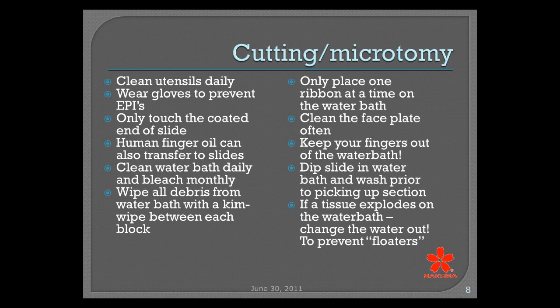I also train my techs to wear gloves when they're cutting. This is going to prevent epithelials from your fingers getting all over your slides. That's especially important when we start talking about immunohistochemistries with things like keratins and stuff, because those can turn out to be positive. So we want to prevent those epithelials from getting onto our slides.